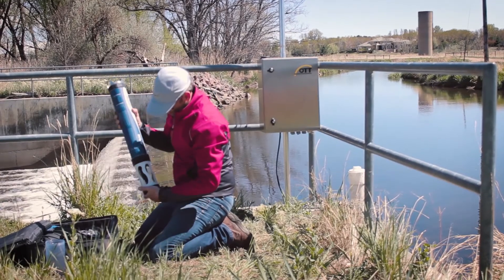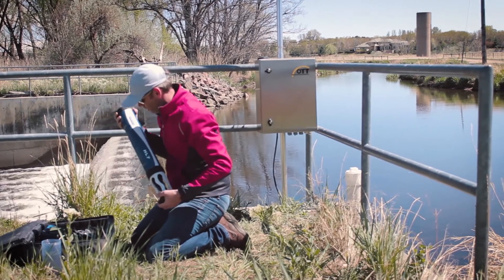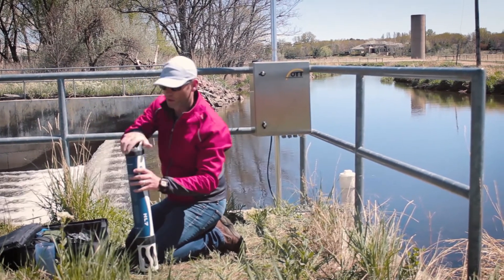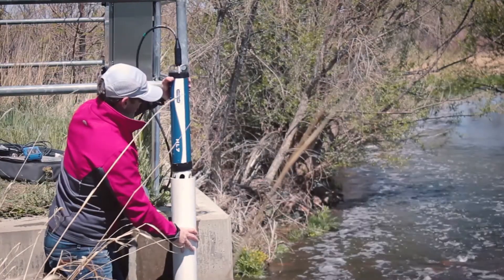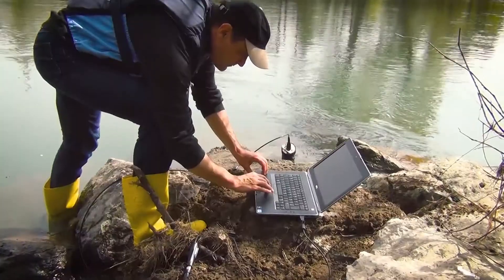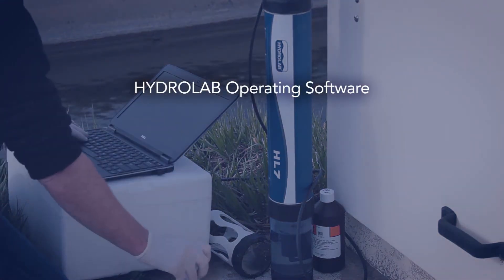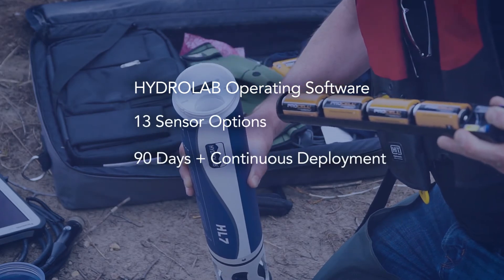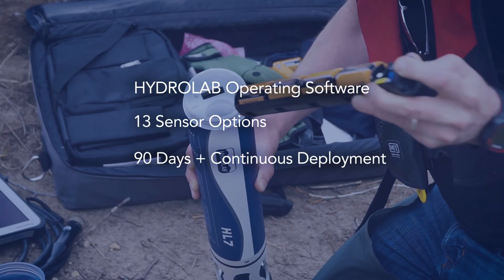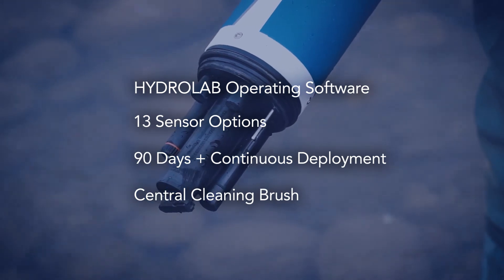HydroLab helps you make better decisions, minimize errors and increase efficiency in the lab and on the deployment site. HydroLab HL7 — a new water quality sonde for data you can trust, with simple and intuitive guided software for unmatched usability, proven sensor technology, extended battery life of more than 90 days, and reduced biofouling with the central cleaning brush.